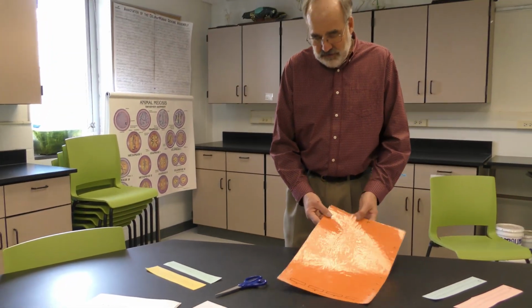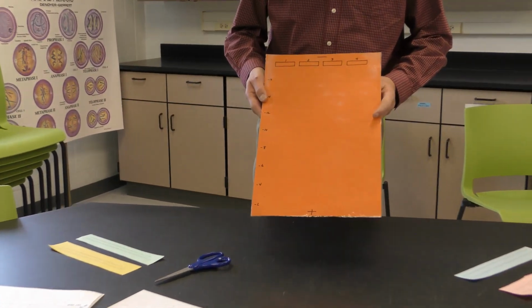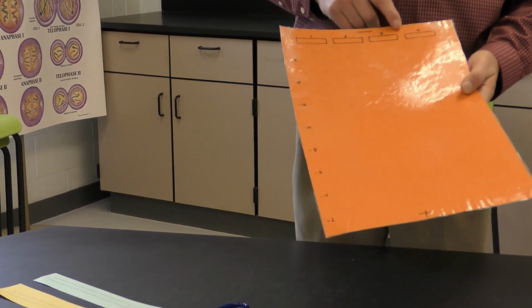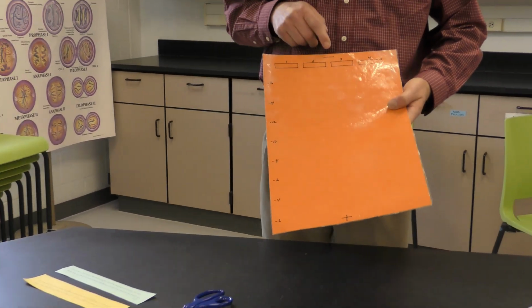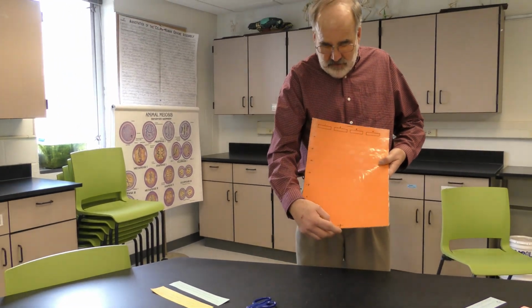This represents the gel box that we're going to use in this modeling exercise. In the first activity with our actual gel, we had 8 wells. In this case, we only have 4 wells, representing DNA 1, 2, 3, and 4 up at the top. Closest to the negative electrode, which is the cathode, and the positive anode is down here.